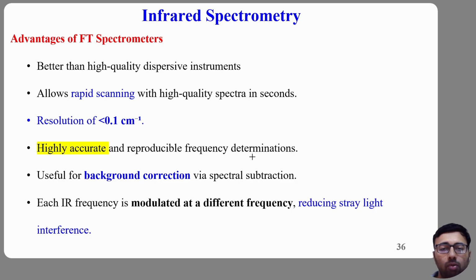Let us summarize today's lecture, in which we have learned how modern FTIR spectrometers are built around the Michelson interferometer. Single beam systems record a background spectrum first and then compare the sample spectrum computationally. Double beam systems alternately measure reference and sample beams using synchronized mirrors. Modern single beam systems dominate today because modern sources and detectors are extremely stable.